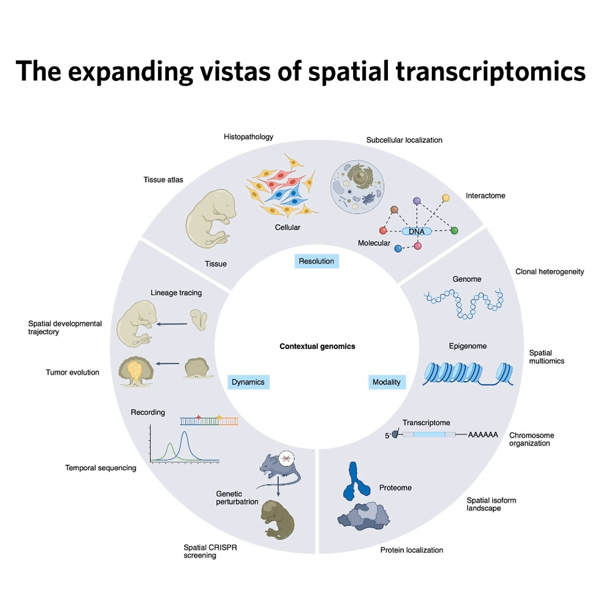And the second? The second is spatial accuracy. This is really challenged by something called lateral diffusion. Ah, right. That's when the RNA molecule kind of floats sideways away from its original spot before it gets captured by a barcode, blurring the map. Exactly. It degrades the precision of your spatial map. And because both sensitivity and diffusion can change wildly depending on the tissue itself, think about things like how much RNase enzyme is present, which chews up RNA, or how densely packed the cells are, the field is, well, it's practically screaming for standardization. It's hard to compare apples to oranges right now.